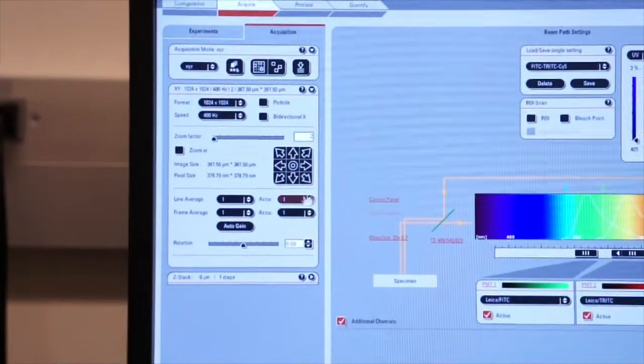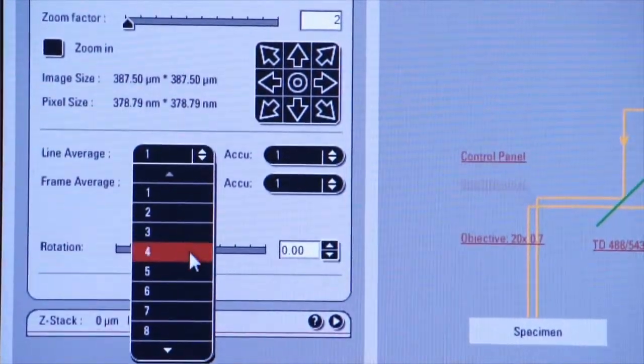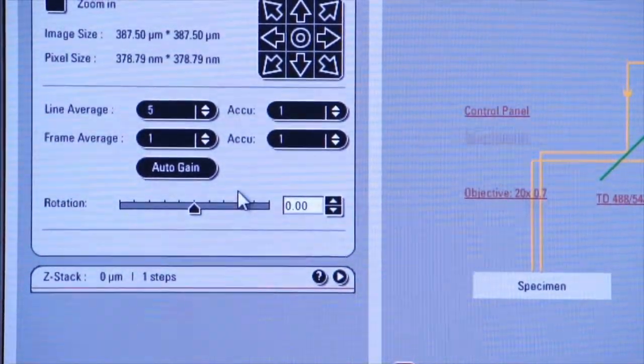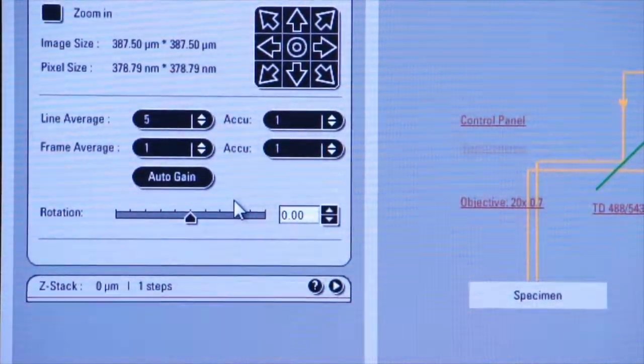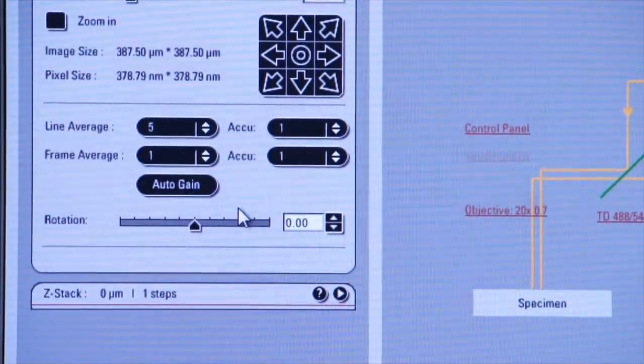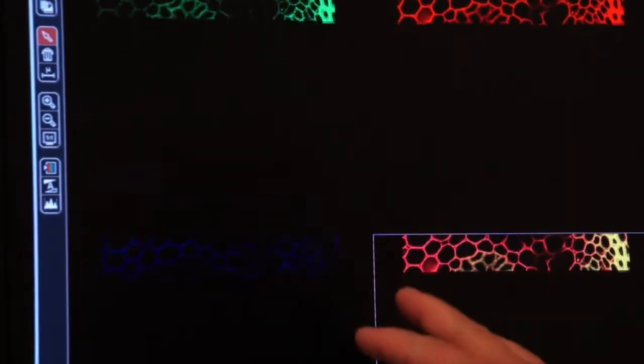Well if we go back over to the other screen now we can implement line average and here we're going to average out the information from five different line scans. Because we're scanning each line five times this will slow down. I'm going to click on capture an image and you can watch the screen here and you'll see the image being collected and now you can see it's a little bit slower.